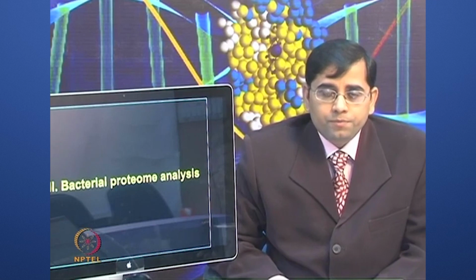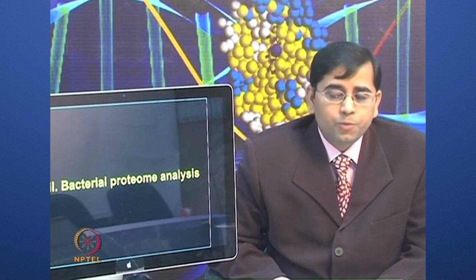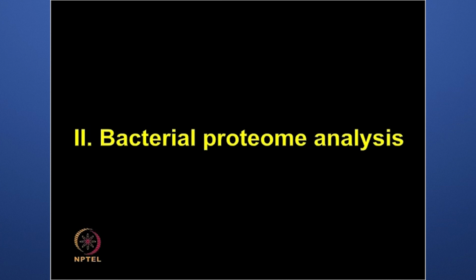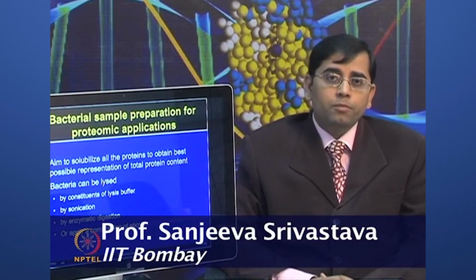So, I hope your video demo was effective for you to demonstrate the steps for serum proteome analysis. Now, let us move on to the second example of how to perform bacterial proteome analysis. So, let us talk about the sample preparation for bacterial proteome applications.